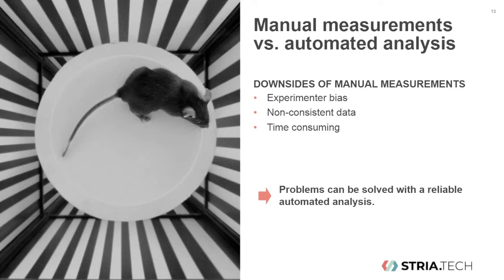What is the main challenge in such vision research? Research on eye diseases and vision disorders is usually carried out with rodents, especially mice and rats. For that, it is essential that the researcher can identify how well that animal can see. We have already seen that the optomotor reflex can give you an answer to that question. However, if you were to analyze the animal behavior manually, there would be several problems.